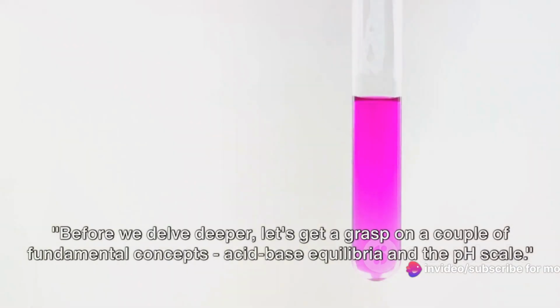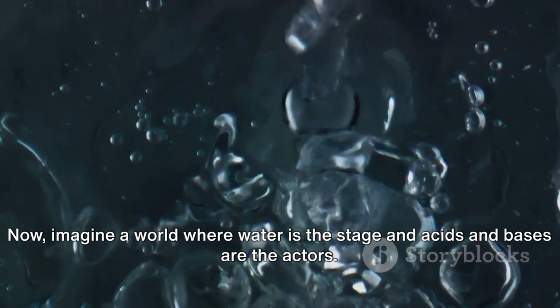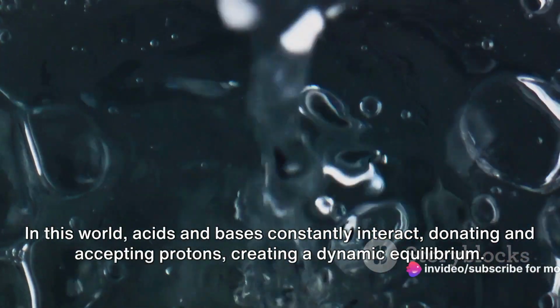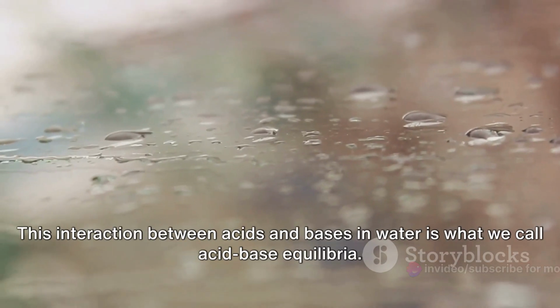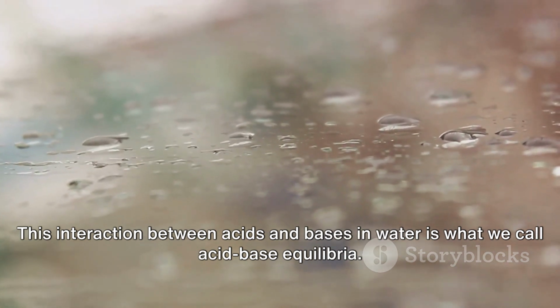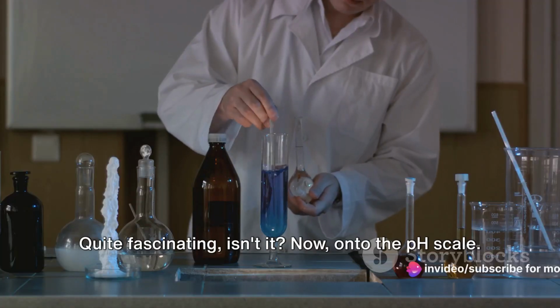Buckle up. Before we delve deeper, let's get a grasp on a couple of fundamental concepts: acid-base equilibria and the pH scale. Now imagine a world where water is the stage and acids and bases are the actors. In this world, acids and bases constantly interact, donating and accepting protons, creating a dynamic equilibrium. This interaction between acids and bases in water is what we call acid-base equilibria. Quite fascinating, isn't it? Now, onto the pH scale.